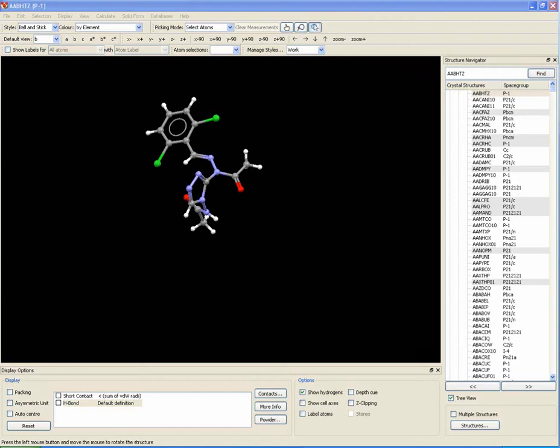Take this molecule, the first entry in the database for example. We can show what is adjacent to it in this direction by doing this.